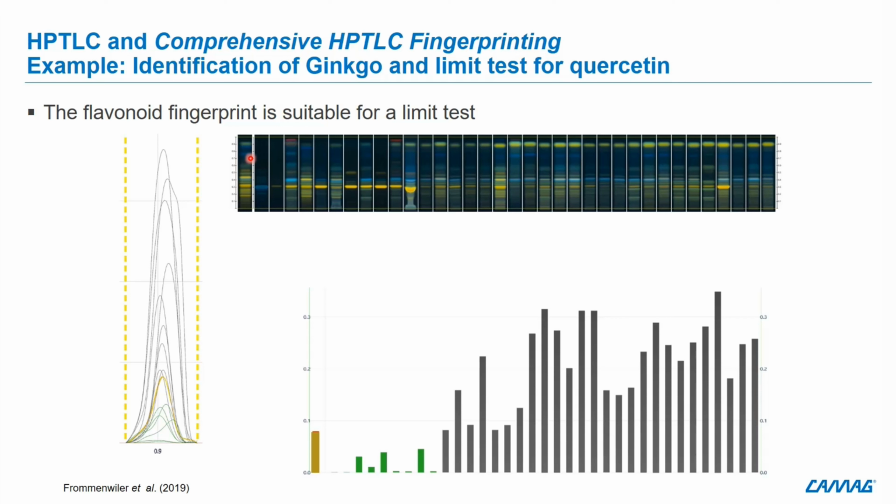Comprehensive HPTLC fingerprinting addresses also the overall intensity of the fingerprint and relative intensities of zones within. That means the electronic image of a sample, which is typically used for identification of herbals, contains also quantitative information. With this information, besides confirmation of the identity, right or wrong, the purity, mixture of different species or plant parts, and content of marker substances can be determined.